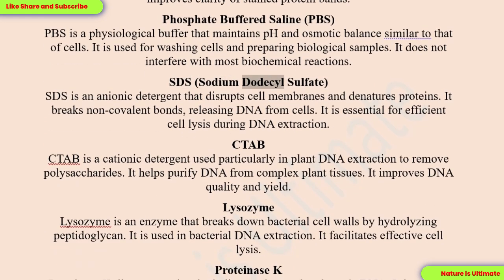SDS, sodium dodecyl sulfate. SDS is an anionic detergent that disrupts cell membranes and denatures proteins. It breaks non-covalent bonds, releasing DNA from cells. It is essential for efficient cell lysis during DNA extraction.